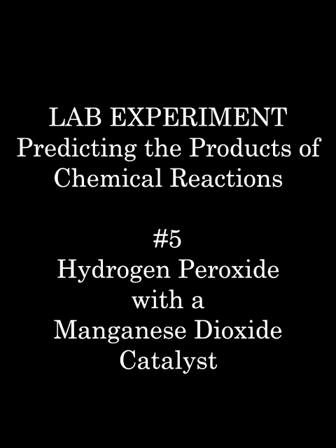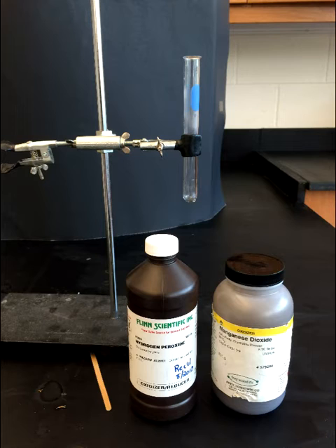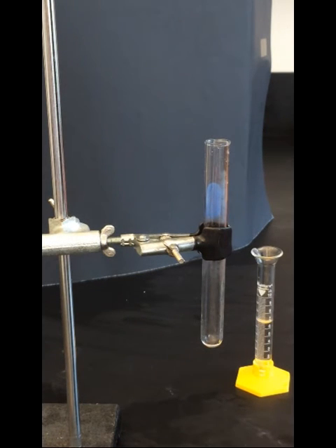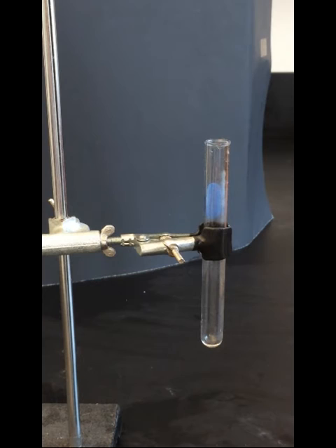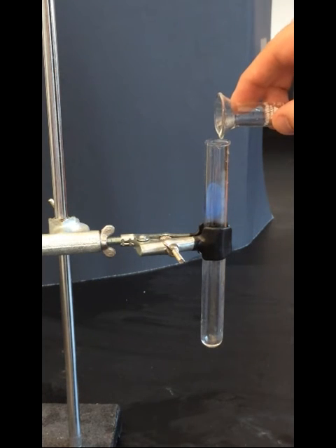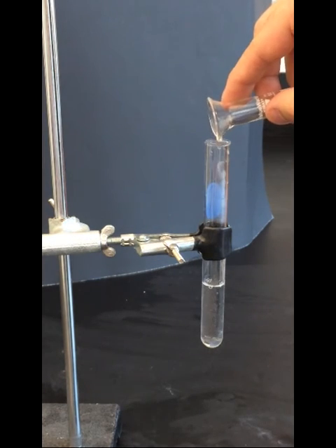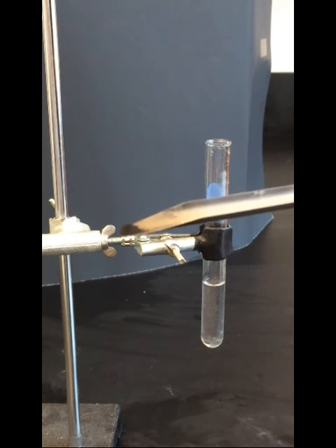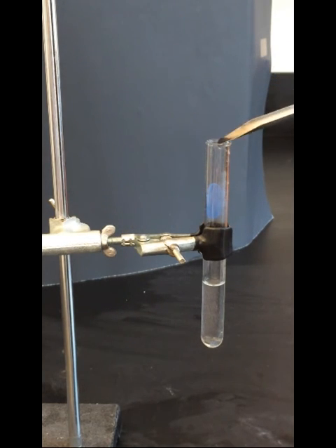In the final experiment, we will be adding a manganese dioxide catalyst to hydrogen peroxide solution. A catalyst is a substance that speeds up a reaction, but is not actually consumed in the process. Approximately 5 milliliters of hydrogen peroxide solution is measured out and then added to the test tube. A very small amount of the manganese dioxide catalyst is then added to the test tube.